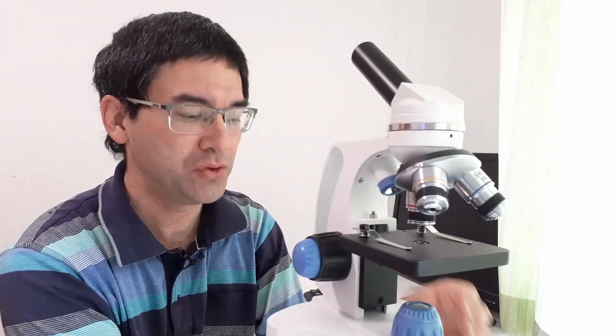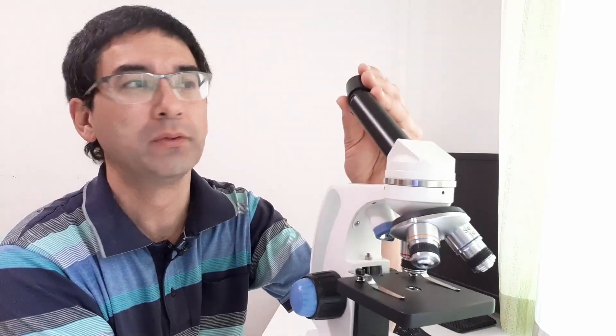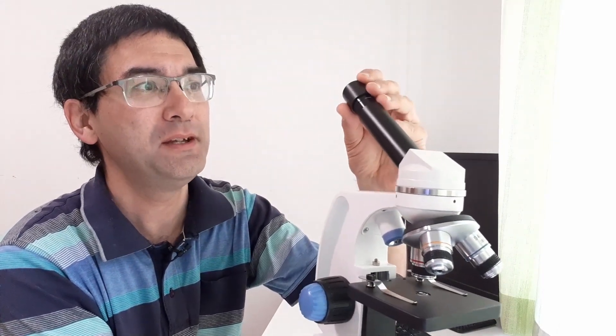I think it's a very good microscope to start off microscopy with, also quite suitable for children. I forgot to put the eyepiece in here.